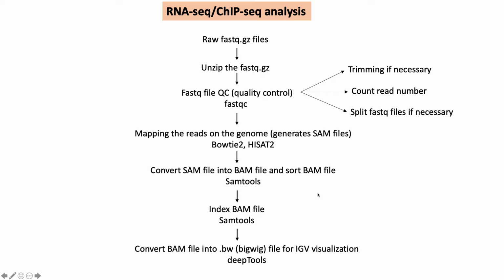So don't worry about all these file names. They have nothing to do with your actual biology; this is just computational complexity. You don't have to worry about why they are named SAM or BAM or BigWig. They're just names that the people who developed these files gave them, based on some of the characteristic features of those files. But as far as biology is concerned, it means nothing.